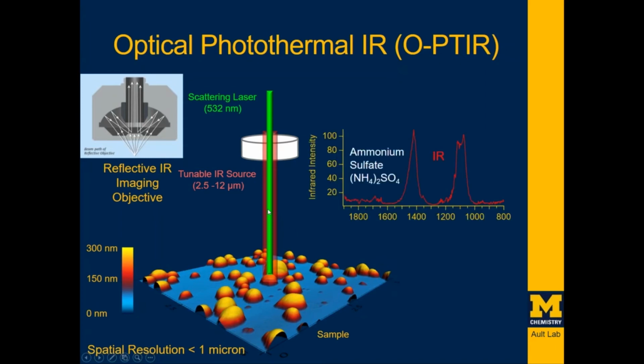When the particle expands and changes the scattering signal, after the data is processed, you're able to work back to the linear spectrum. Here you can see a gorgeous ammonium sulfate spectrum. We were really excited; this is one of the first spectra we collected. It worked very well in giving us similar intensities for the ammonium bend right here, as well as the asymmetric vibration of the sulfate ion. Those are just the calculations that we've done.